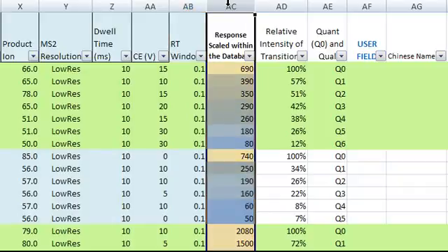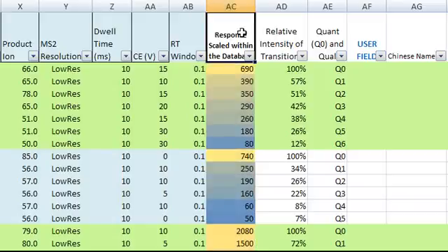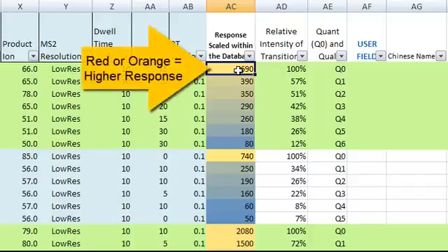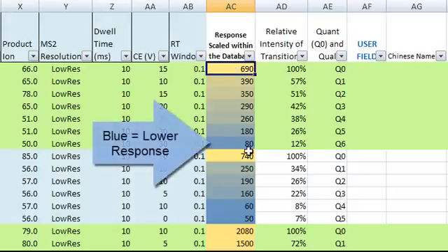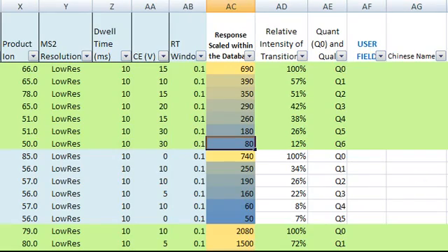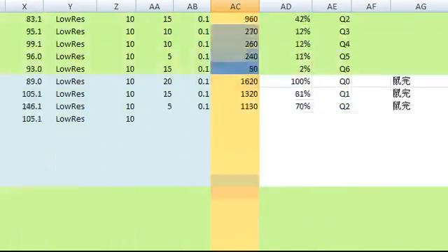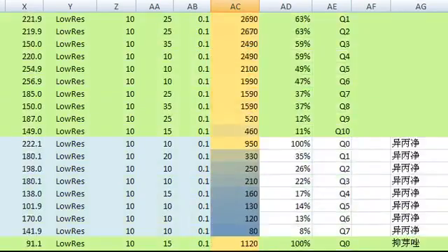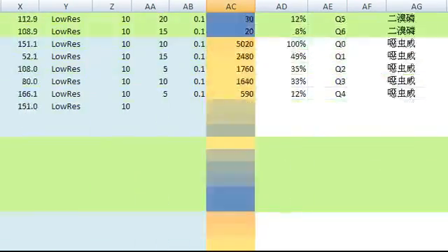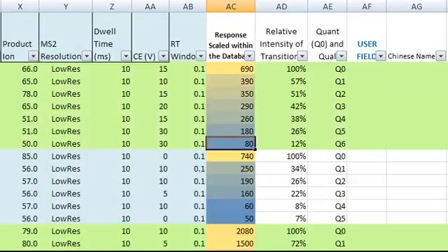The next column shows the response of each individual transition and how it's scaled among all transitions in this database. The number in each cell is a reference value. This column is color scaled, where red or orange indicates a higher value while blue or dark blue indicates a lower value. By glancing at the different colors in this column, you can quickly tell that some of the transitions are more responsive and some are less responsive.